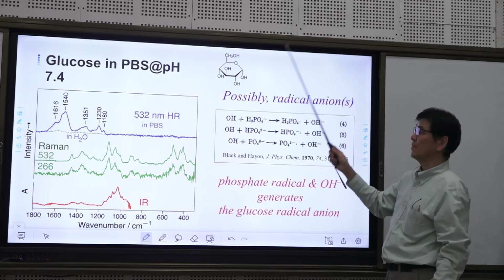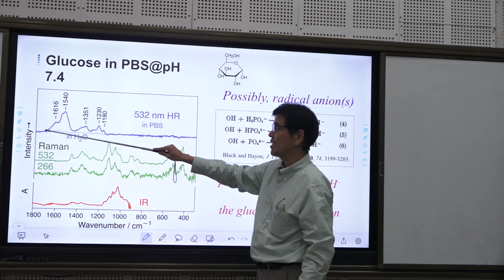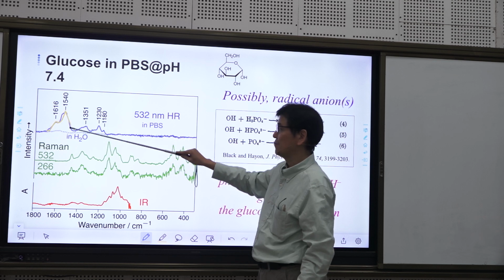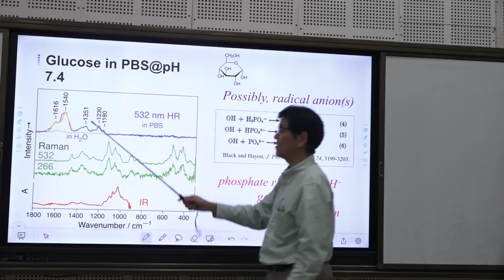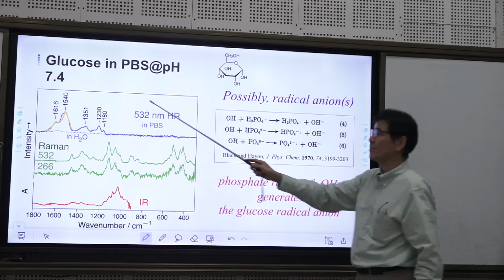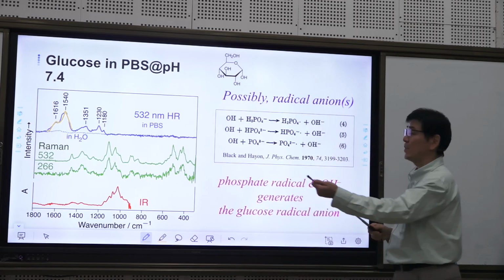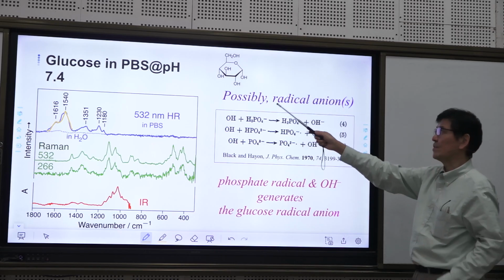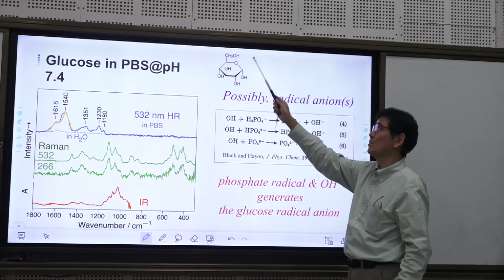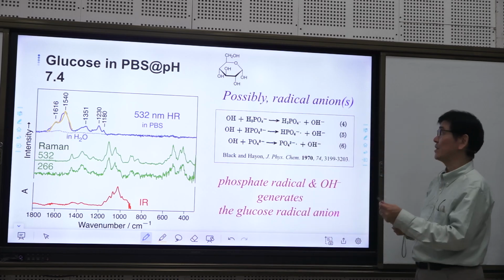Okay, so it's time to return to the glucose signal. Again, it is about 1500, and probably it is not a vibration of the glucose itself. We can expect it should be the radical anion of glucose.